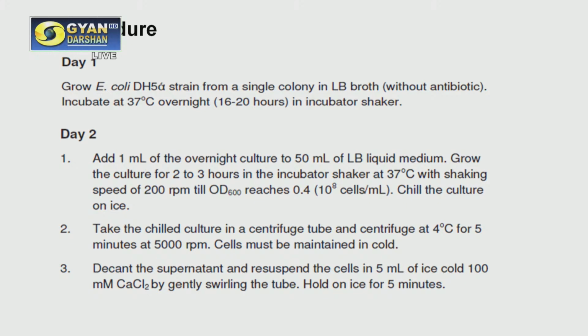And this Luria-Bertani actually consists of peptone, yeast extract and sodium chloride. So that is the composition of the Luria-Bertani broth or growth medium.